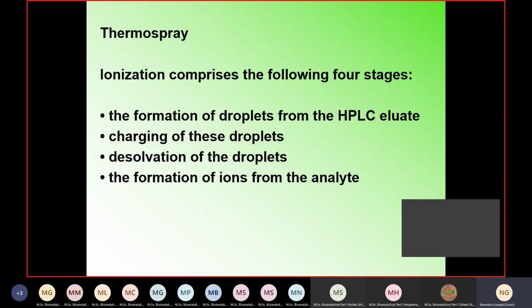Is it not used very amply? Then third, distilled water. What is the third? Acetonitrile. Anybody remembers? Acetonitrile is typically used a lot. So these are the three solvents which are the most popular.